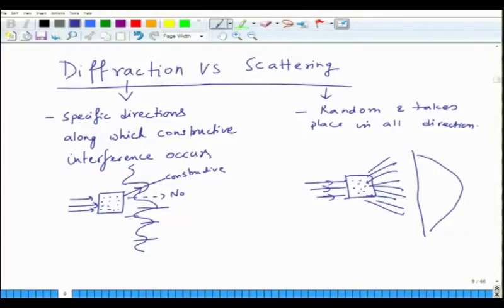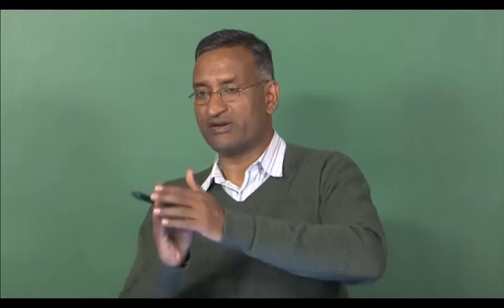I want to ask then, the size of the object here in case of scattering. Size of the object means size of the material? The object, the atoms. Okay. I mean, atoms have a spacing, right? For scattering, we can talk about the atom. Yeah, every atom. If you just have a single atom, a single atom will scatter, but the effect will be weaker. But it's only when you have multiple atoms.